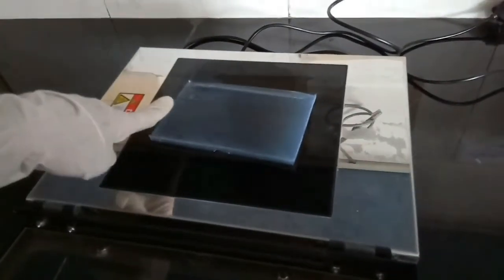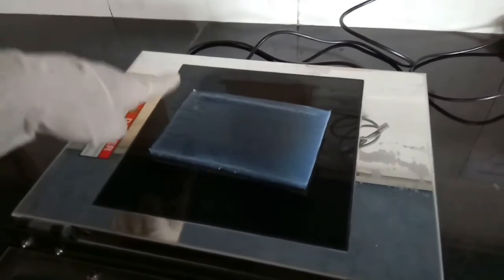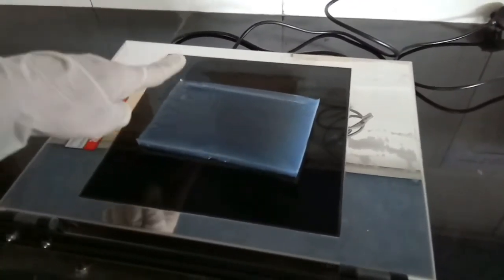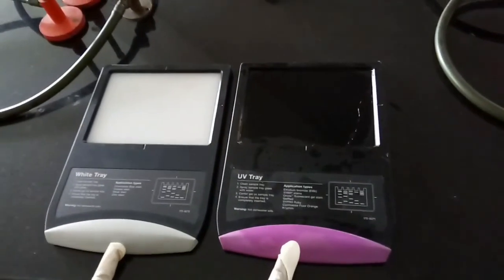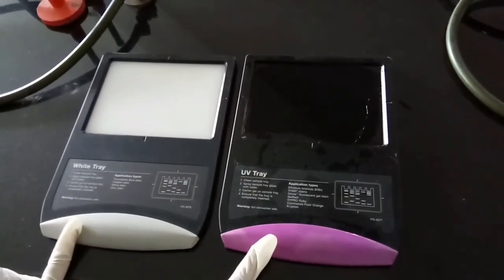We will open the lid and now we will place the gel into the UV tray for further gel documentation. For gel documentation, there are two trays available to us, the UV tray and the white tray.